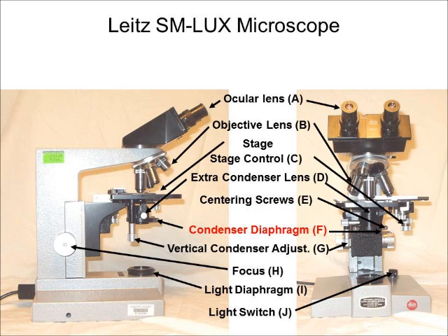Near the bottom of the condenser you will find an armature — that is the condenser diaphragm. This regulates the amount of light passing through the condenser and controls the depth of field, that is, what is in focus at any one particular time. This is very important for obtaining optimal resolution. On the very bottom of the condenser is the vertical condenser adjustment, which moves the entire condenser assembly up and down so that it is in focus. Again, this is important for obtaining optimal resolution.